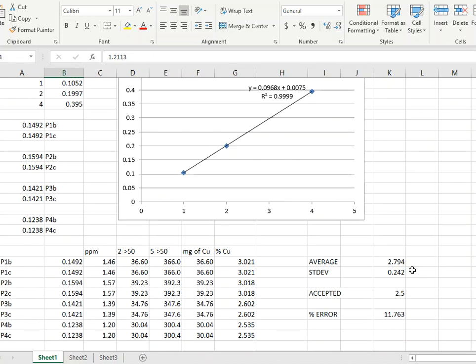Remember, the data is only as good as the user for the instrumentation, and you want to be very careful when you make your standards. You want to make sure that lamp is really optically aligned and that it is maximized to its full potential before you start running all of these samples on the machine. Don't trust that someone else has done it before you. Because if you do, and their numbers are wrong, it's going to make your numbers wrong as well because you didn't double check it. So always double check the instrumentation settings before you run it.